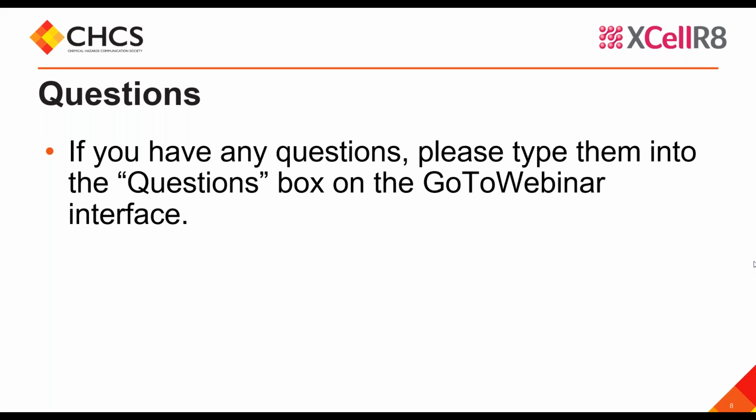So I know that there's always been some concerns about the performance of that test, and now ironically we use that as our benchmark to validate the in vitro test because it's the only benchmark we have. So to some extent we're always working with a moving target, and we just have to make the very best assessment that we can with the information that we have, and err on the side of caution where necessary.